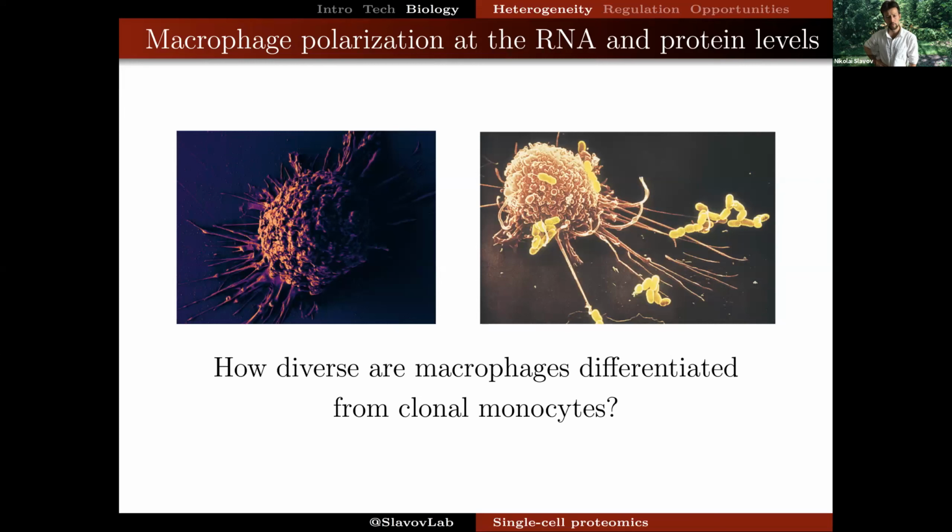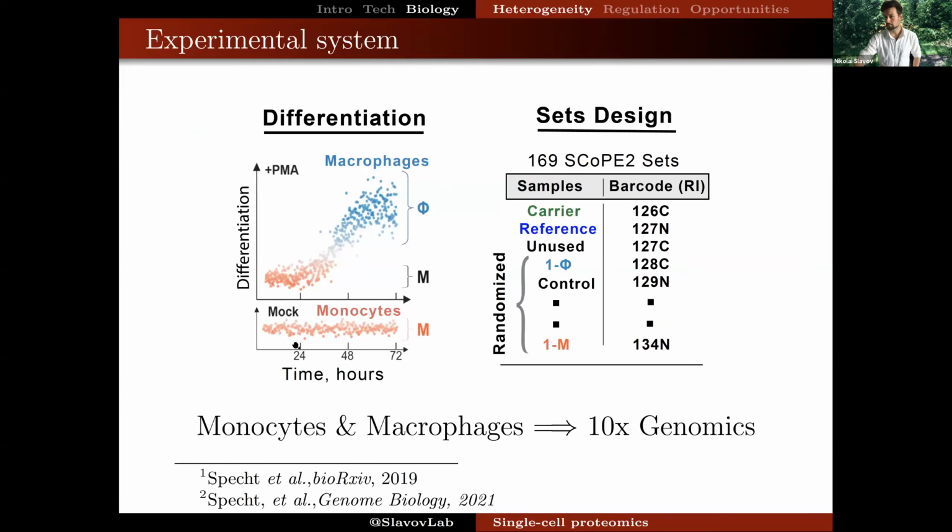And in this particular case, we were interested to explore the heterogeneity that might emerge as isogenic clonal population of monocytes differentiate into macrophages. And of course, macrophages are a very, very diverse cell type of the innate immune system. So we were interested to see if heterogeneity in those cells might emerge even in the absence of polarizing cytokines. And as we did this experiment, we also wanted to compare the results from doing single cell protein analysis to doing RNA analysis with a popular platform, 10x Genomics.